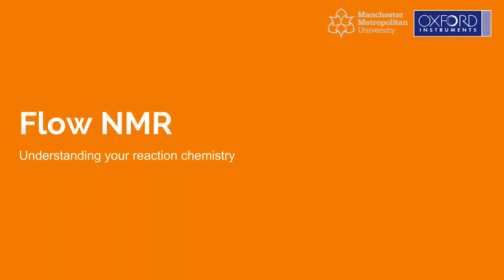Hi everybody, hopefully you can all hear me. So I'm going to take you through some of the work I've been doing on the flow NMR system that I've got here at Manchester Metropolitan University. What I'm going to show to you is not an exhaustive list of experiments. I'm hoping it's going to stimulate some discussion, get you thinking about what kind of chemistry you could do that utilizes the flow NMR that I'm going to talk to you about.